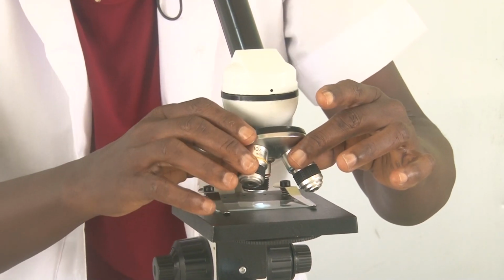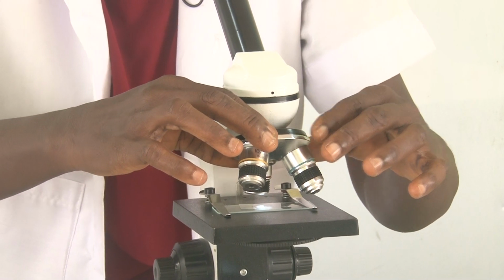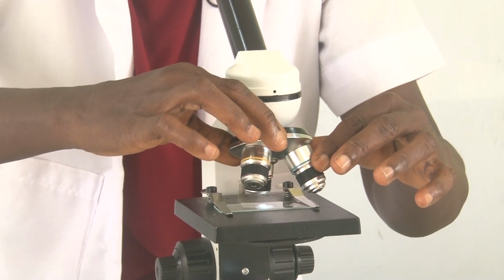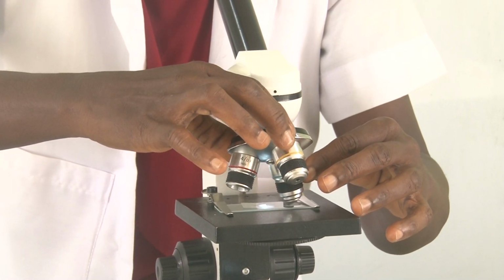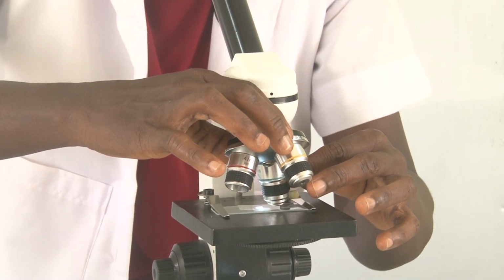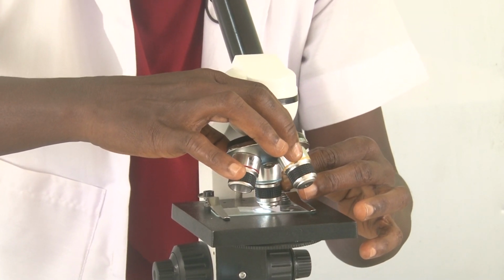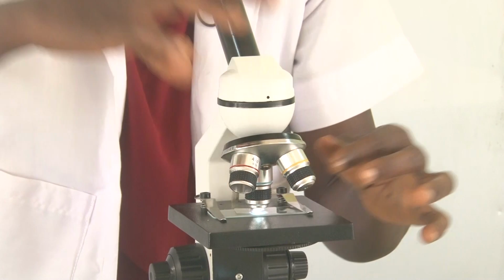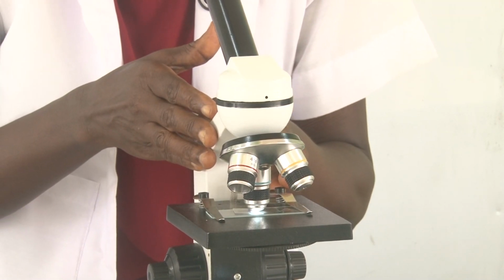Now, what you do is turn the revolving nose piece and turn from the low power and bring the high power onto the center of the stage. When it's there, you hear a click. So now the high power is in view.